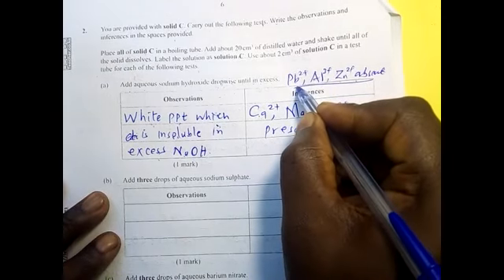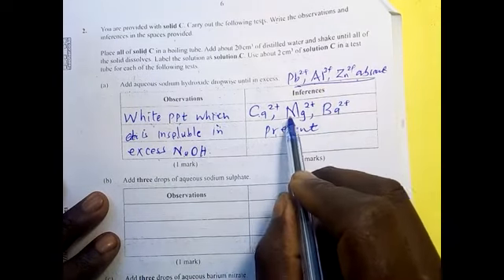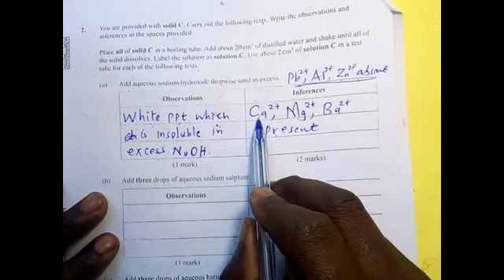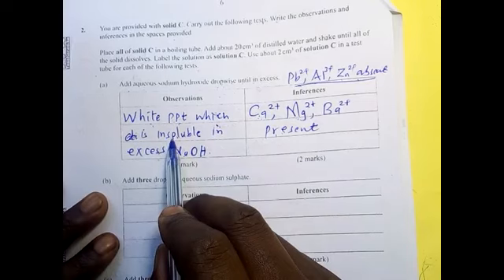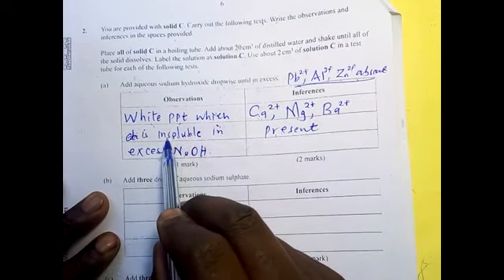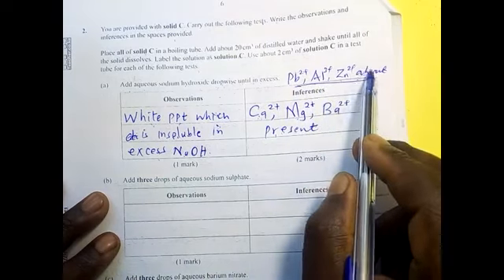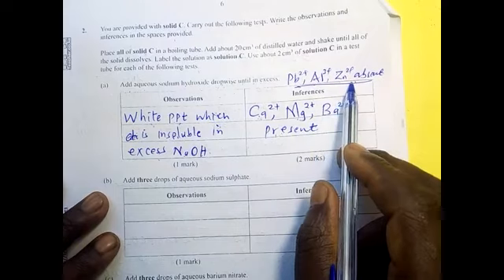If it is not there, then tell us what is there. That's why I've given you what is there: whenever this happens, what is there is calcium, magnesium, and barium. If it happens otherwise, and the white precipitate dissolves to form a colorless solution, write these ions present. Don't write these ions absent. Write what is there. Thank you.